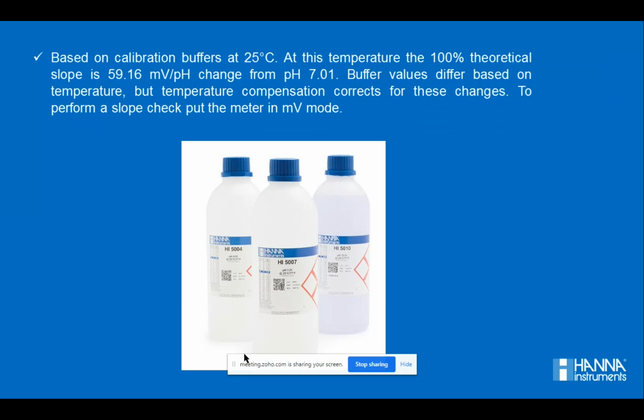The slope value at 25 degrees centigrade is 59.16 millivolts per pH. It means that if you switch from 1 pH to 2 pH, or from 3 pH to 4 pH, or from 6 pH to 7 pH, the millivolt difference at 25 degrees centigrade must theoretically be equal to 59.16, but it of course has an acceptance window of plus or minus 4 millivolts.